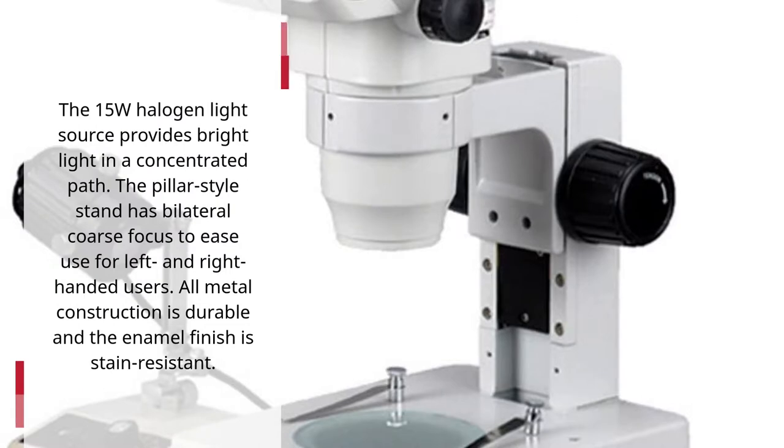The 15-watt halogen light source provides bright light and a concentrated path. The pillar-style stand has bilateral coarse focus to ease use for left- and right-handed users. All metal construction is durable and the enamel finish is stain-resistant.